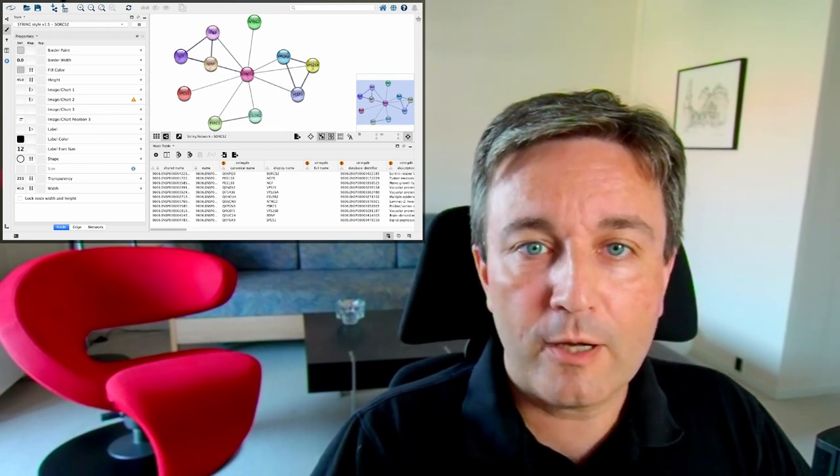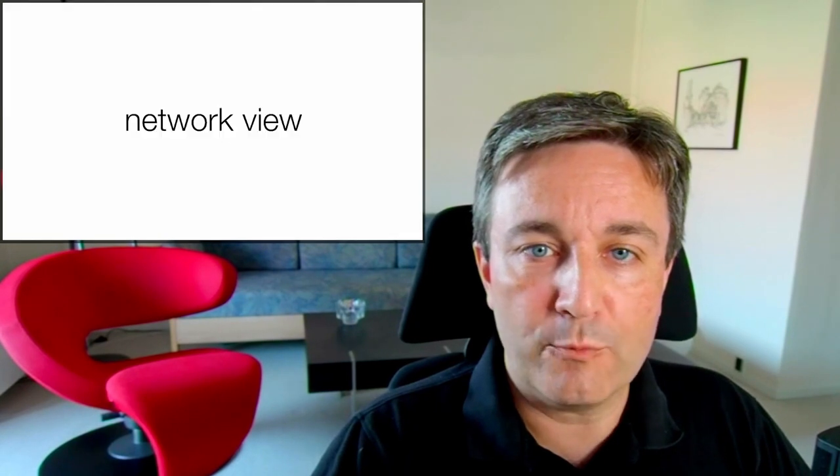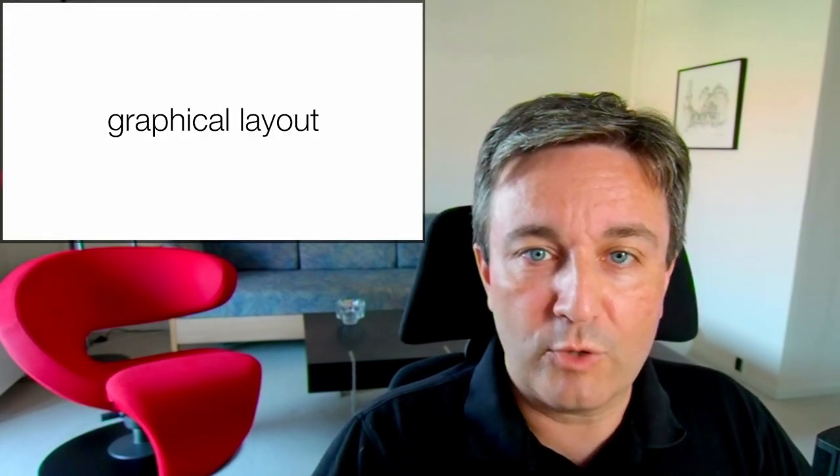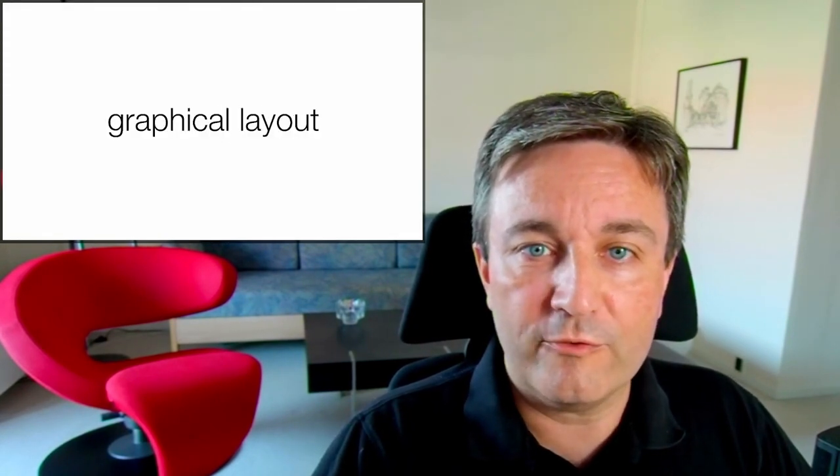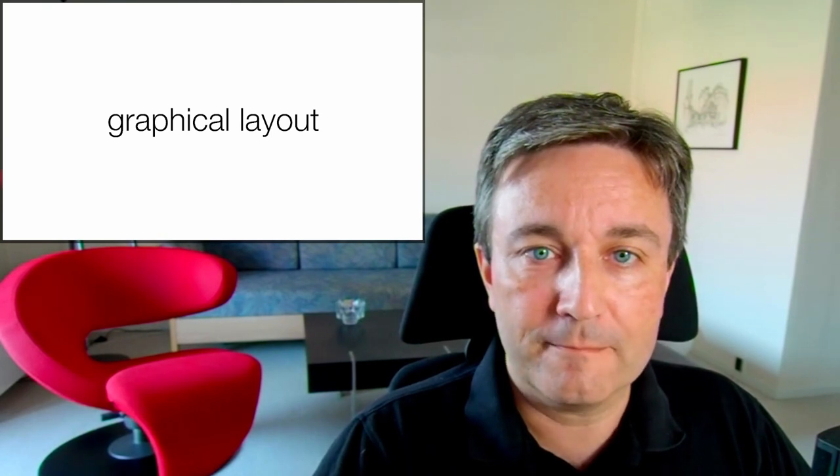In the upper right corner, you see the network view. That is where you have a graphical layout of the network, which you can interact with.